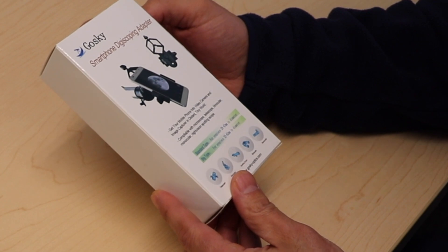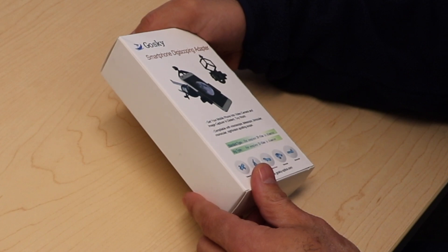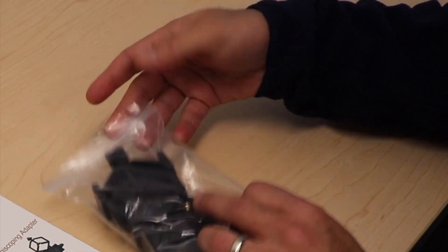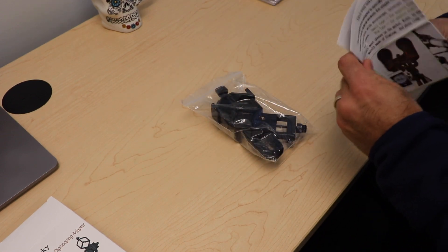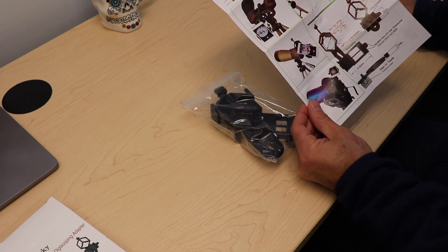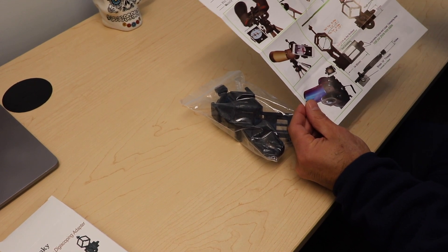This is what the box looks like. I bought this on Amazon for $20 with Prime shipping — you can get it within one or two days, so plenty of time for the holidays. Pretty simple packaging, just a white box. Inside, you'll find a nice ziplock bag with all the components and a brochure showing product details on how to attach it to various optical devices. It's not just compatible with microscopes, but also binoculars and other devices.